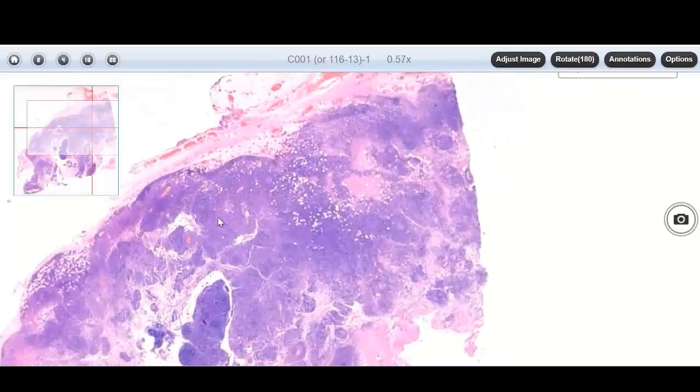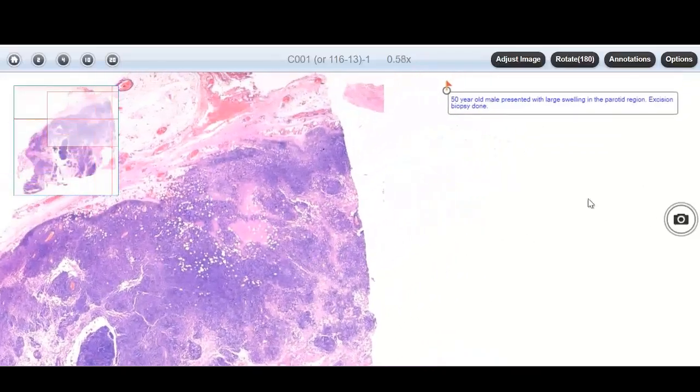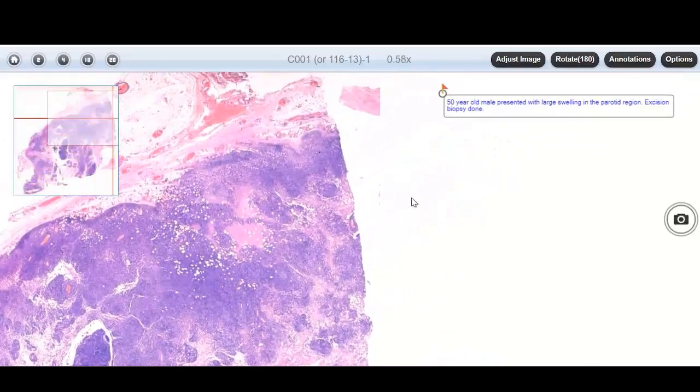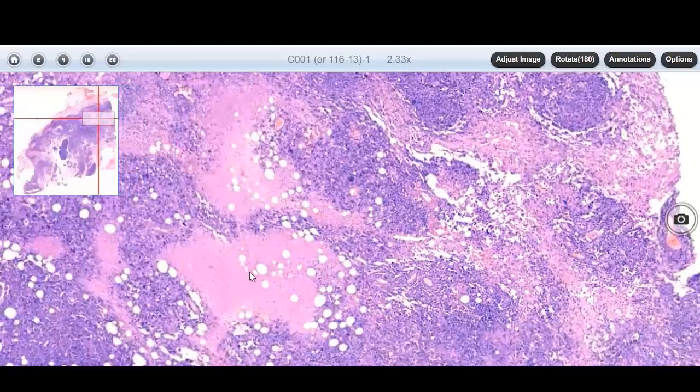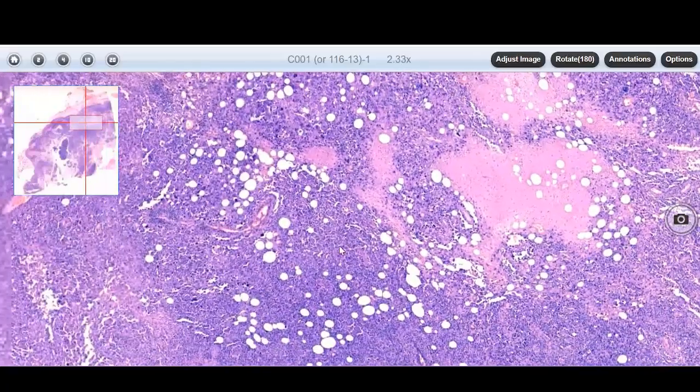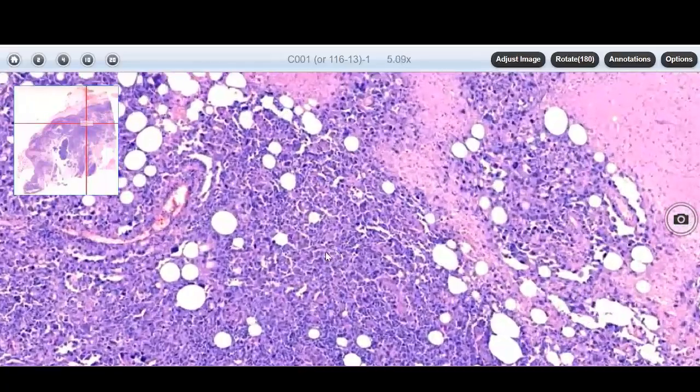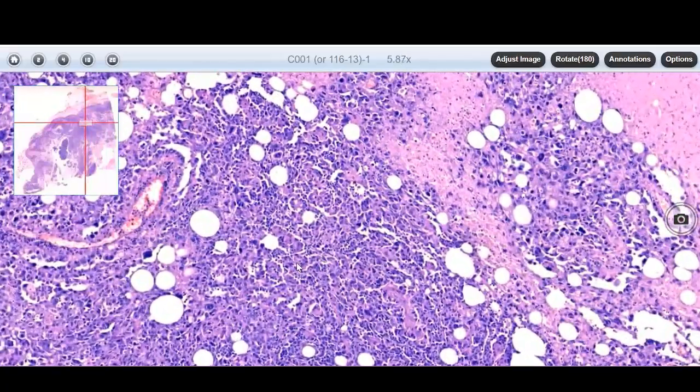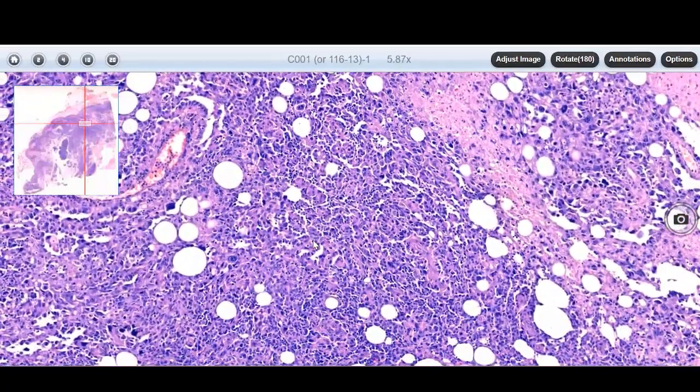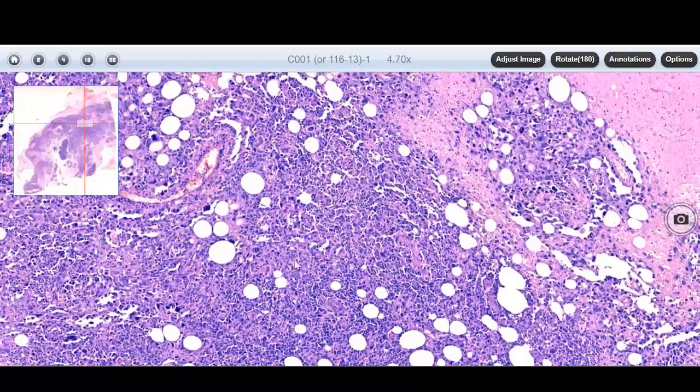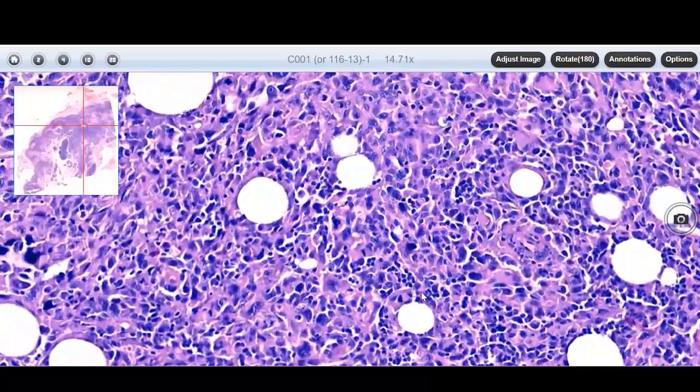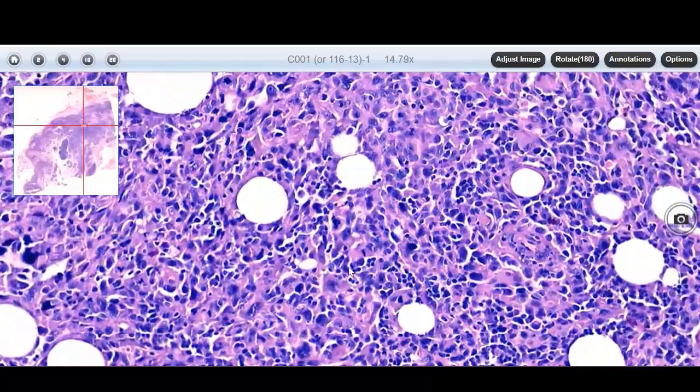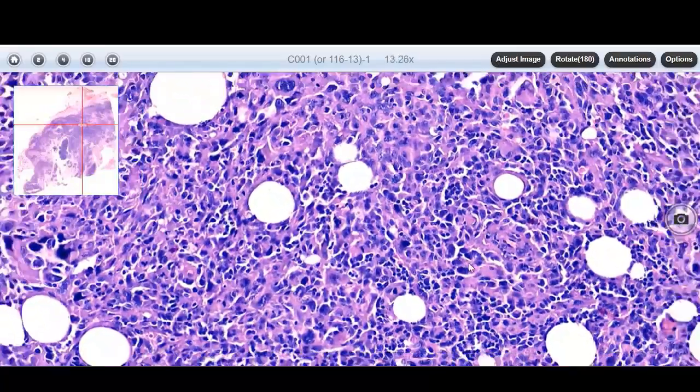All these slides are accompanied with a brief history. The images are very clear and you can see them under various magnifications.